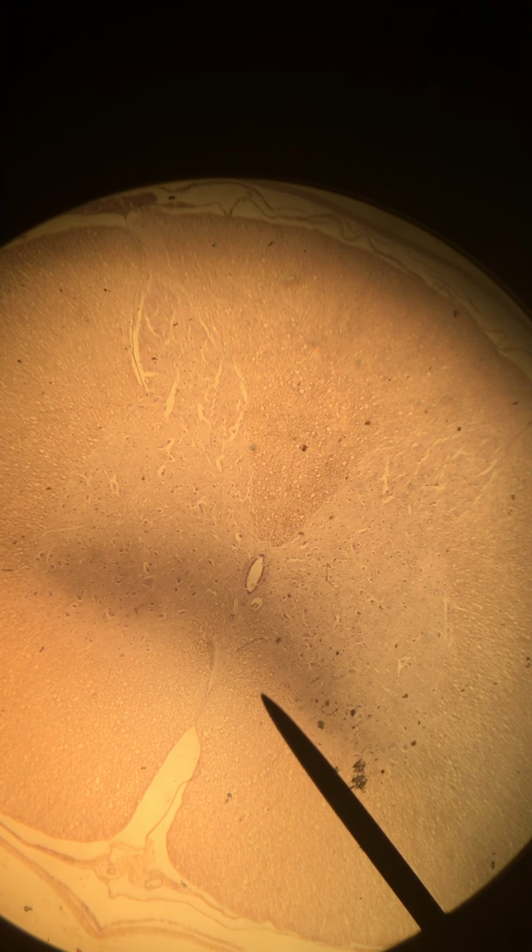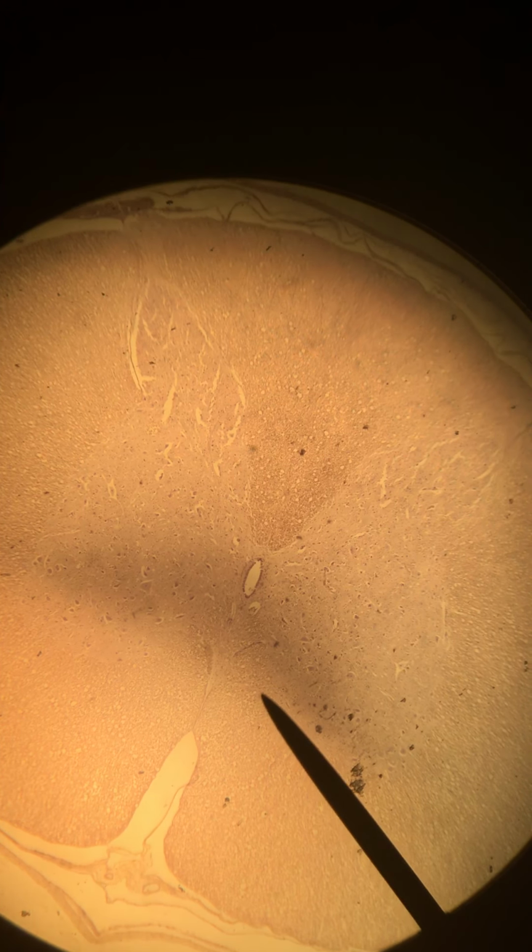Hi guys, this is slide 12, the spinal cord. Right now I have us looking at our lowest magnification, so I just want to show you the overall picture first. So this is the spinal cord. You can see the whole way around there.